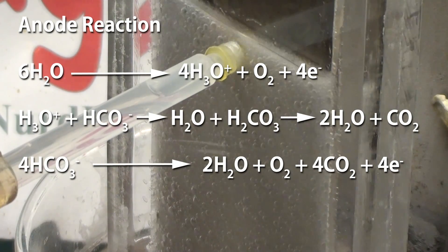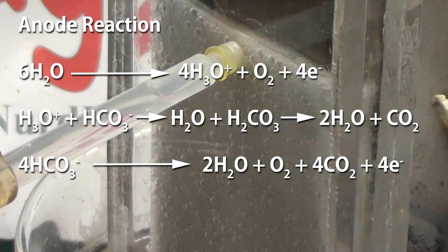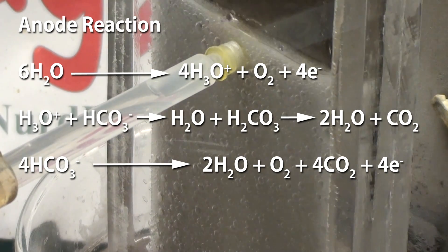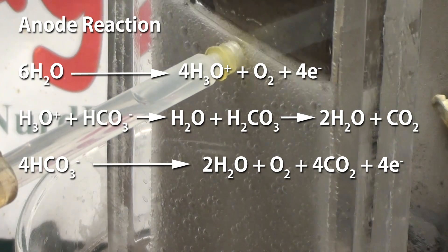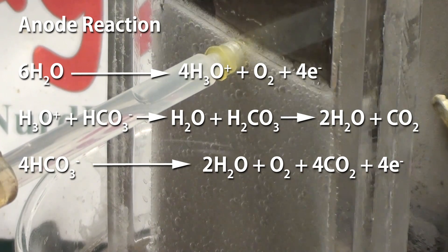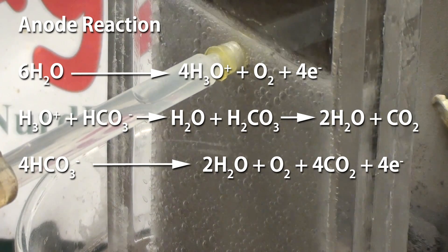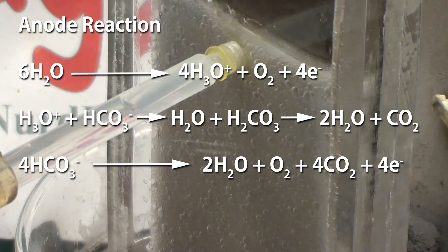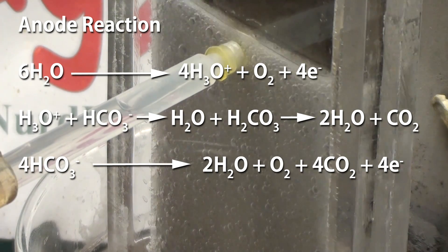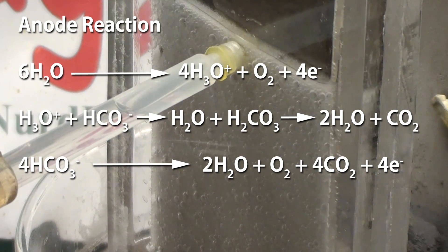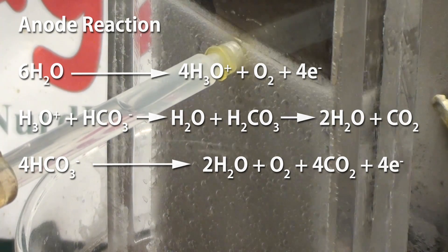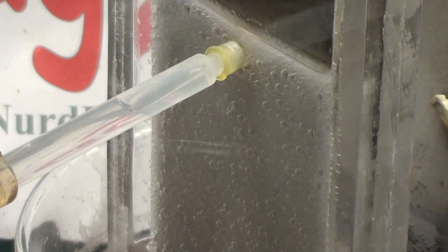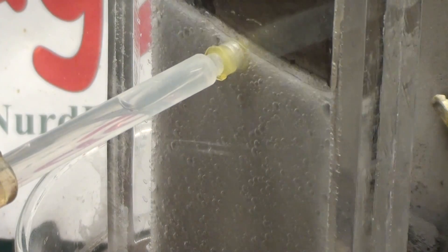Now you may be wondering if the anode reaction produces hydronium ions, which are cations, why don't they diffuse through as well? The answer is they would, but they react with the bicarbonate ions and neutralize them to form carbon dioxide and water. So the pH of the solution remains high and there is never a high enough concentration of hydronium ions to significantly contribute to ion transfer through the membrane.